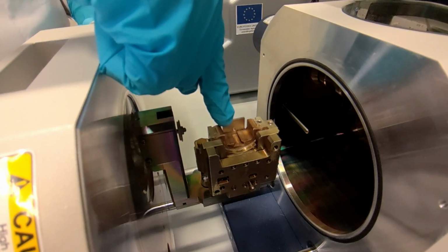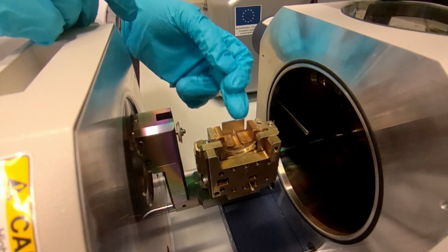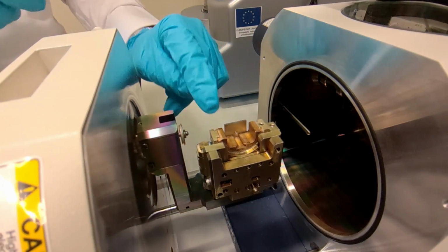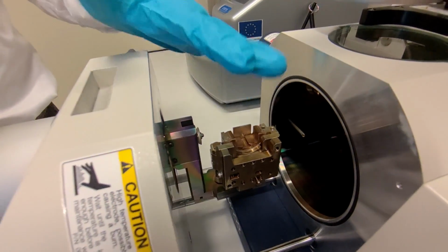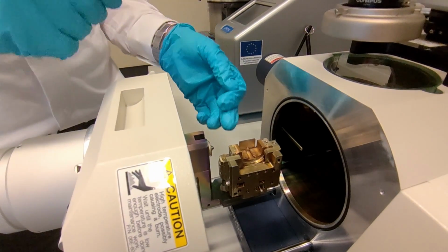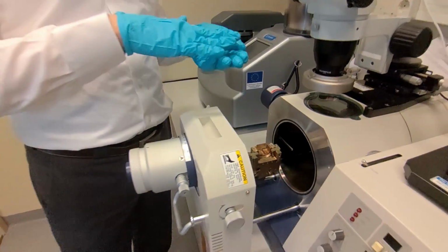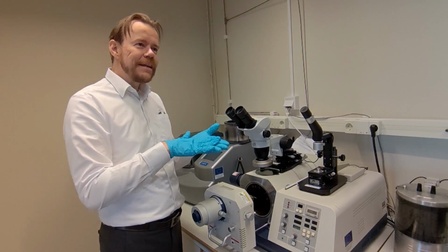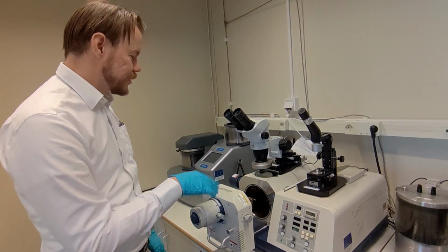These mask pieces are made of titanium. They are consumables, so one can rotate this along, one can flip up each of the 4 edges and move them around. But after a while, this wears down, so then you need to replace them with a new one. This machine also has an extra feature: instead of cross-section milling, it can also do flat polishing. If you have something that is polished, you can make that the last final fine-tuned polishing step to make it super crisp. But we don't use so much of that technique.